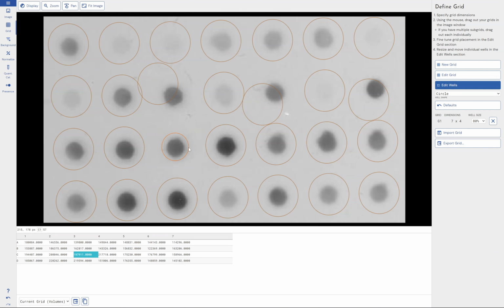And actually, it's much better to err on the side of caution and have a bigger area around your data, your sample, your signal, because we're going to use background subtraction to remove the pixel values around here anyway. So when we define our background subtraction, let's say we've got the area outside here and inside here, the values for these pixels are going to be so similar to that outside where we define our background, the actual measurements are only going to start really about here.